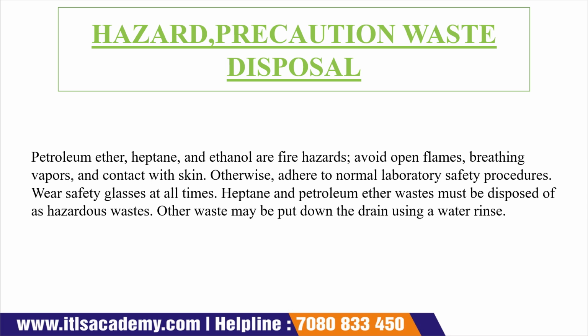Okay, and along with it, we have also followed the normal laboratory procedure: we have to wear glasses, a lab coat, proper shoes, and avoid eating anything inside the lab.